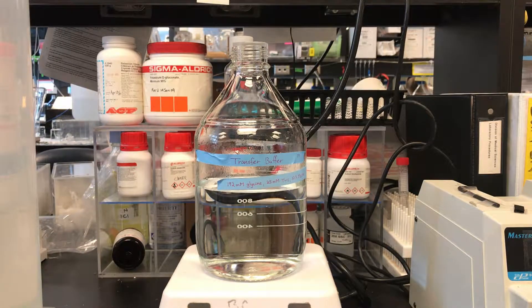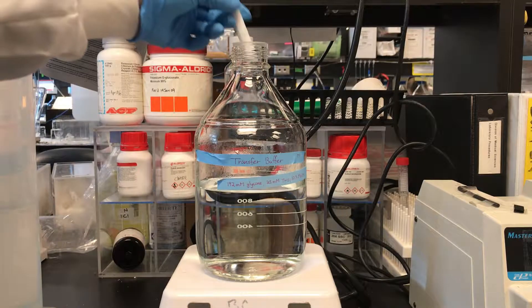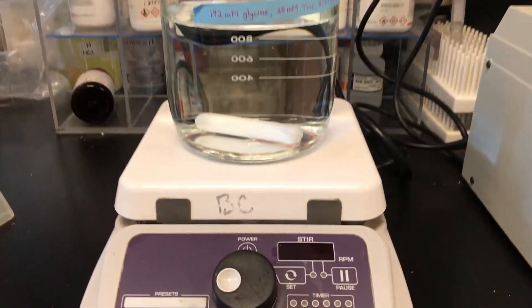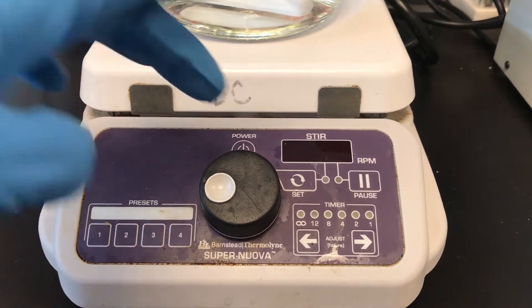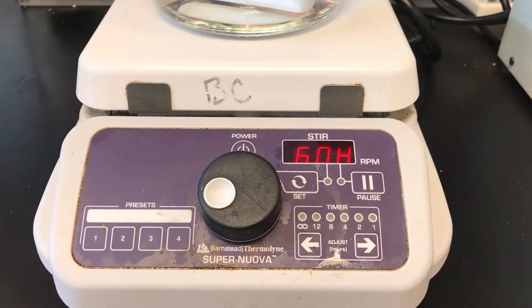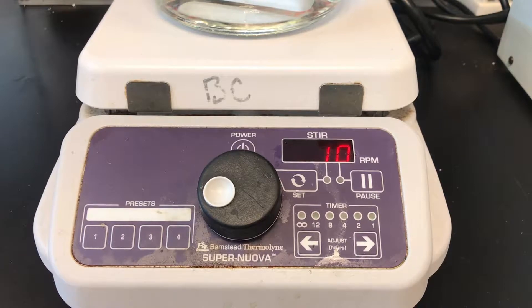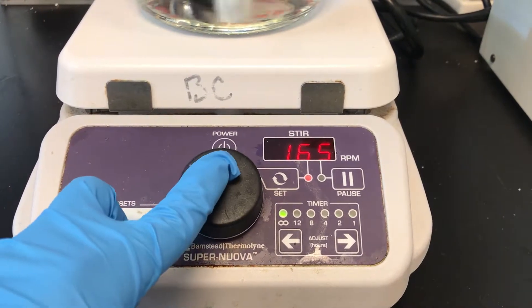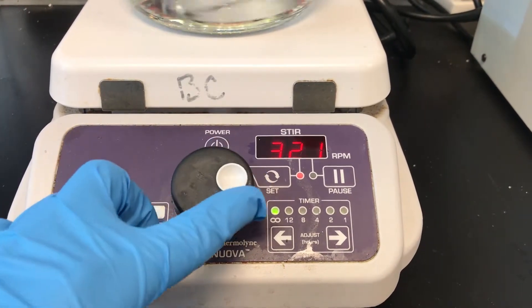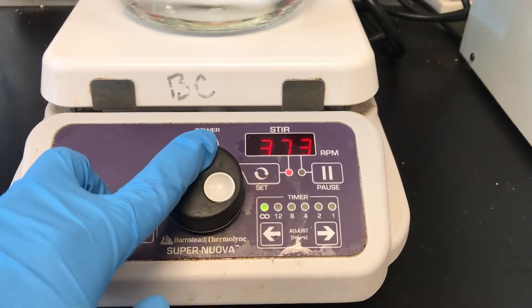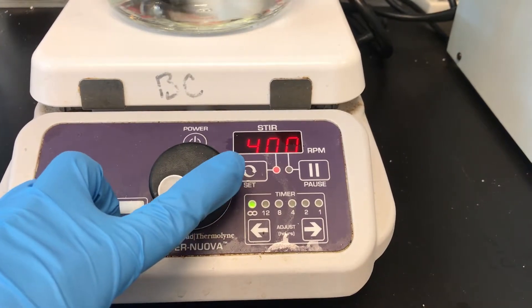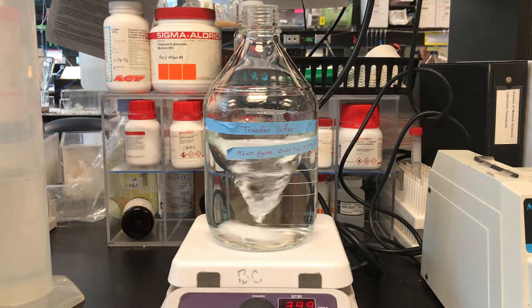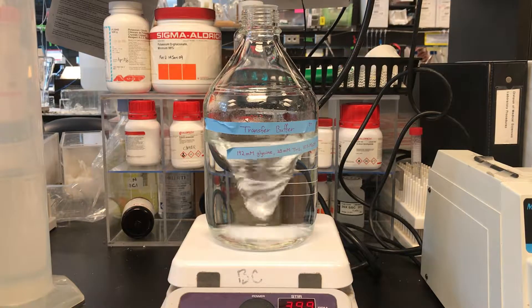Add the magnetic stirrer rod and set the magnetic stirrer until a vortex is present.